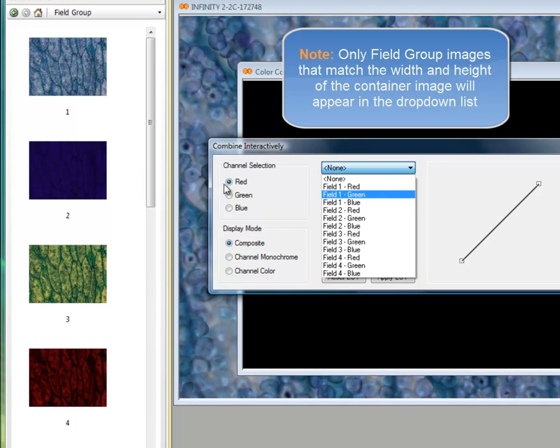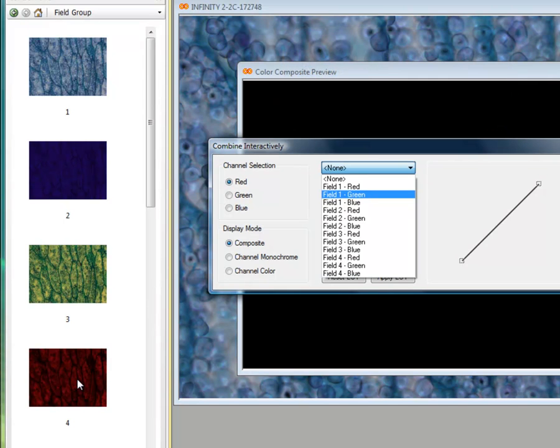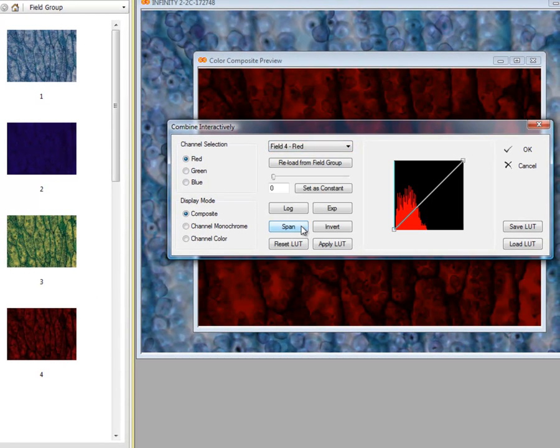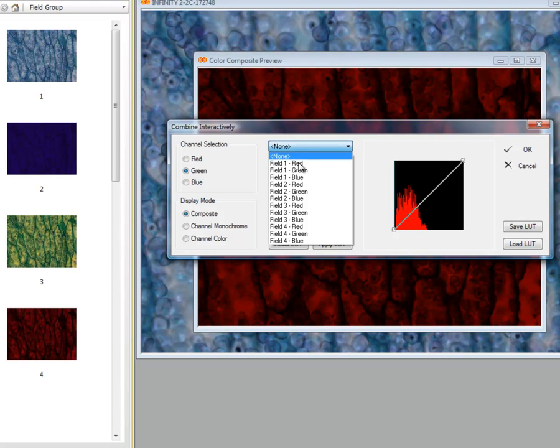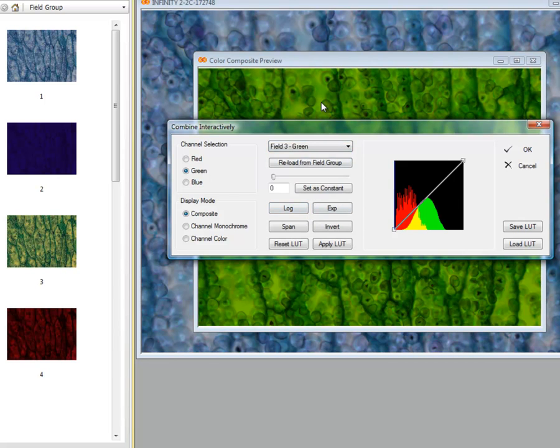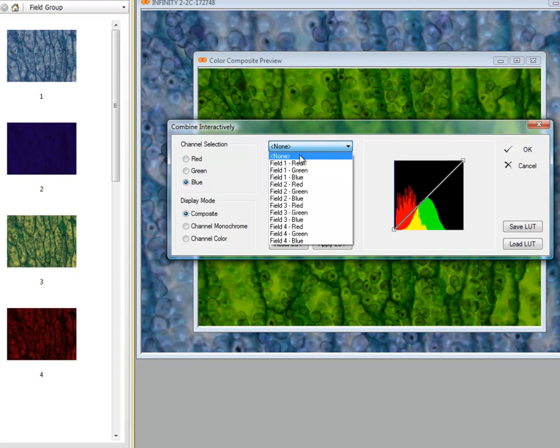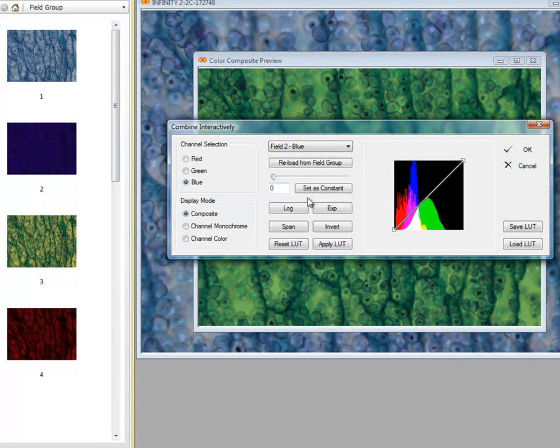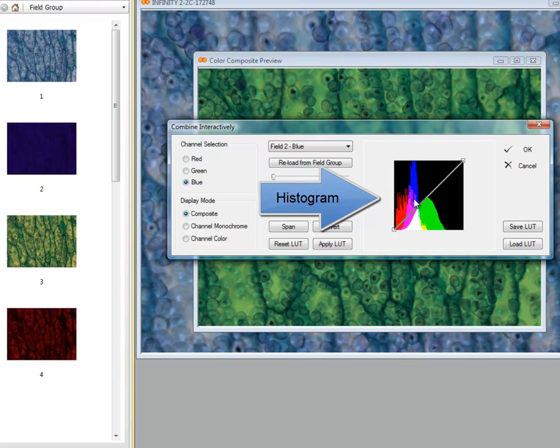Since I'm dealing with my red output channel right now, I'm going to select some input data from this image that was captured using a color camera with a red filter enabled. That's field 4, and I'm interested in the red channel, so I'm going to load that. You see how it appears immediately in the color composite preview behind. I'm going to select my green channel output now, and I'm going to choose the input from this green filtered image — that's field 3. I'm interested in the green channel from that image as my input, so I'm selecting that, and you'll notice it's being added into the color composite preview. Lastly, I'm going to choose my blue channel input from this blue filtered field — field 2 — and I'm adding that in. You'll notice as I added each image, the histogram of the data in each of those three channels is displayed.